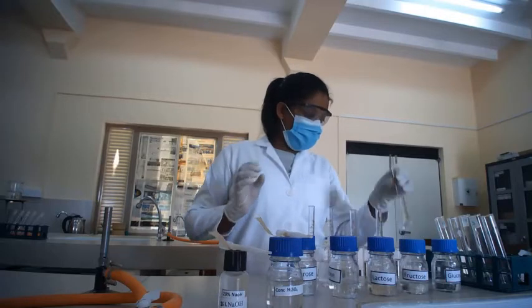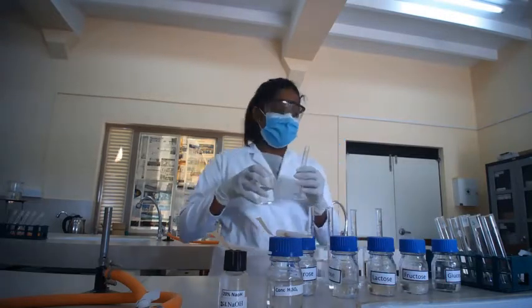Now we are going to get 10 milliliters of each solution to a test tube.